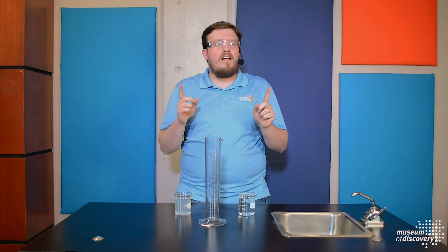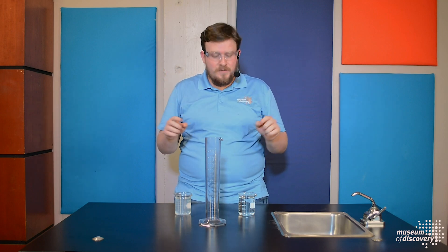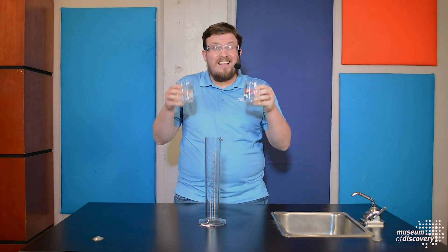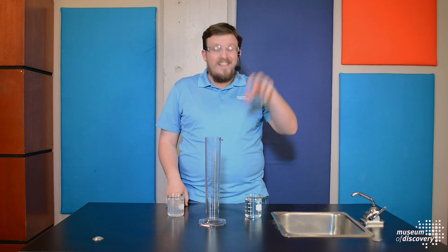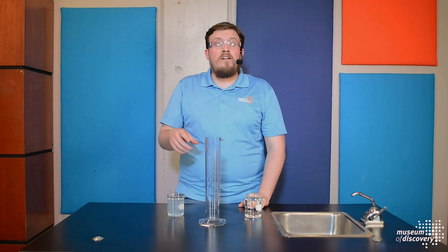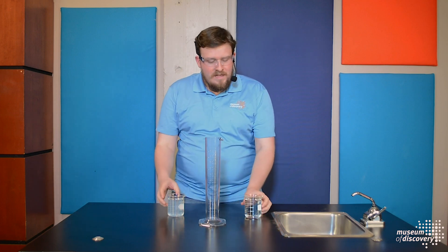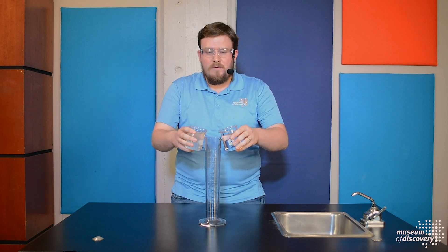For our next demonstration, we're going to be doing a chemical reaction called a clock reaction. They're called clock reactions because after a certain amount of time, we're going to be able to notice a change. We're going to combine two liquids together — we call them clock A and clock B. They may look similar, but they've got different chemicals inside. Clock A is water with potassium iodate. Clock B is water with sodium bisulfite, sulfuric acid, and liquid starch. I'm going to pour an equal amount of each into our cylinder and see what happens.